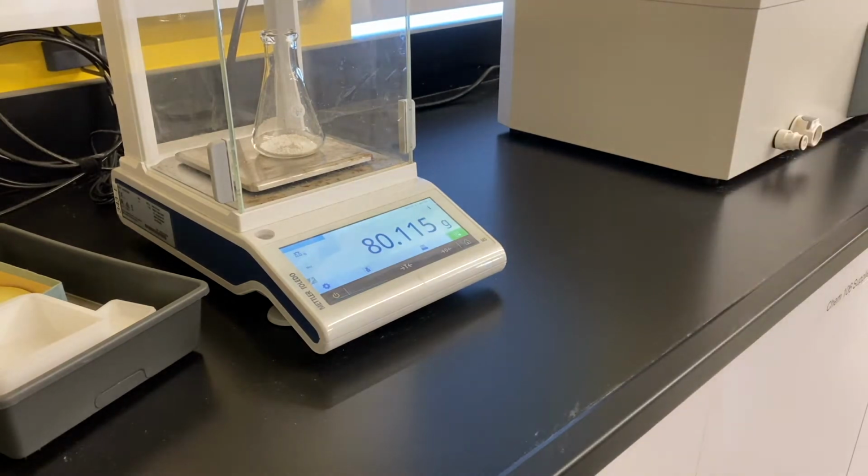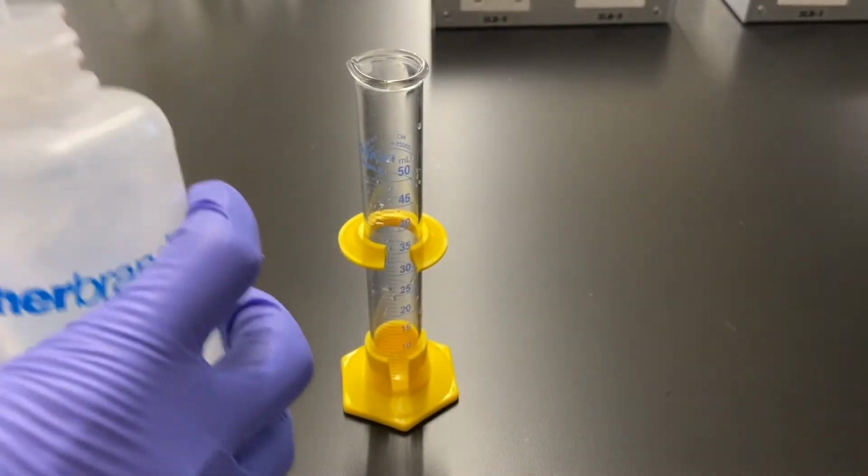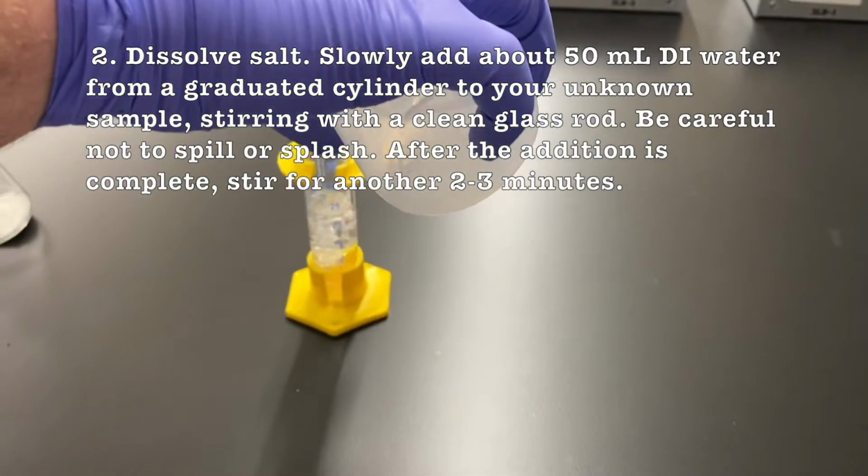So we also massed our Erlenmeyer flask before we added any of our mixture and after, so that we can subtract those masses to get the mass of our mixture.